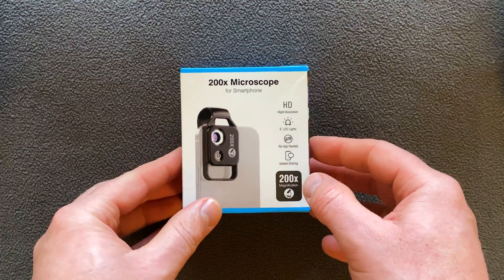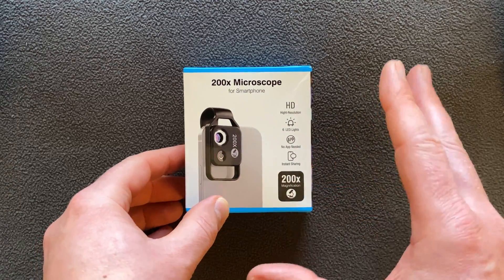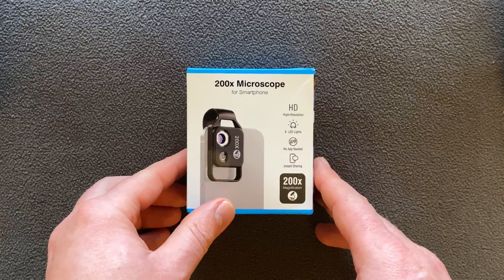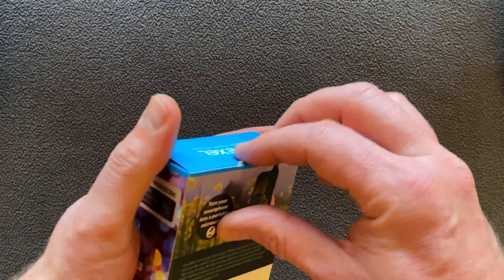You can also see it has 6 LED lights — those are the white light ring that's around the actual lens itself. So you get really good light and colour distribution around whatever you're taking, so that's awesome. It looks like a very simple to use piece of kit, so let's go ahead and unbox this and see what we've got.